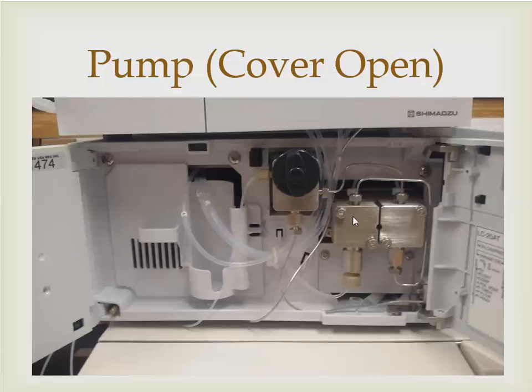Now, the pump is going to create a variable for me. And this variable is something that I want to kind of key in and keep in mind as I do my analysis throughout this project or throughout the experiment that I'm getting ready to do. And this is a very important value. Without this value, I am not able to do anything at all. I need this number. Now, what is this number? This number is called flow rate.